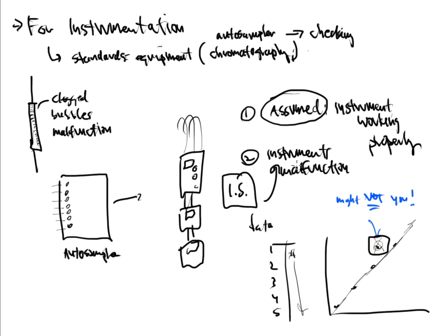Now, there's other reasons to use them, don't get me wrong. There's other reasons to use internal standards, but as an analyst working in a laboratory, this is the biggest reason that we would use an internal standard: to ensure that we are injecting the proper amount every single time that sample goes into the machine. So we're testing the auto sampler. We're testing the instrument for a change. We're not testing you. And that's really the major purpose of an internal standard.